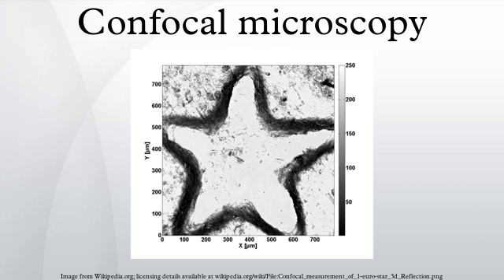Fluorophores/low temperature operability: to image samples at low temperature, two main approaches have been used, both based on the laser scanning confocal microscopy architecture. One approach is to use a continuous flow cryostat, where only the sample is at low temperature and it is optically addressed through a transparent window. Another possible approach is to have part of the optics in a cryogenic storage dewar. This second approach, although more cumbersome, guarantees better mechanical stability and avoids the losses due to the window. Images. References.